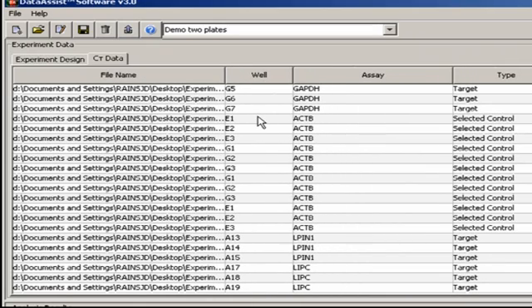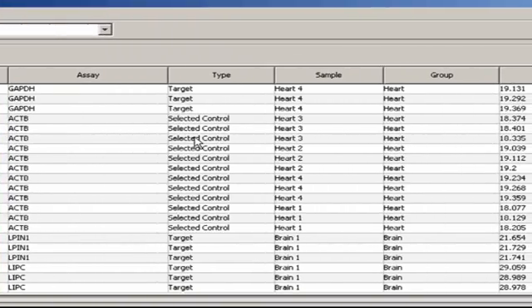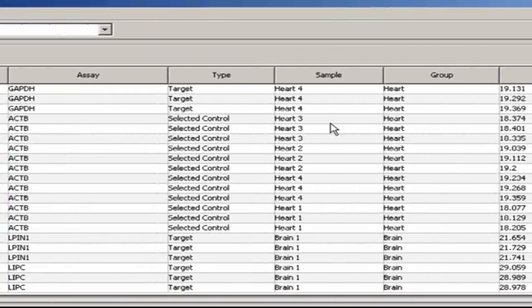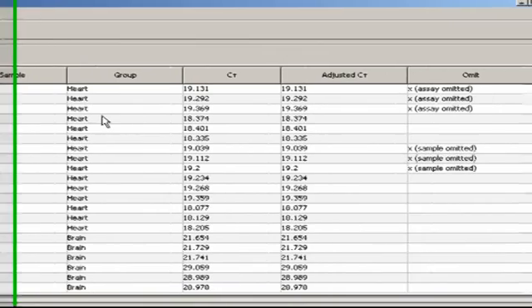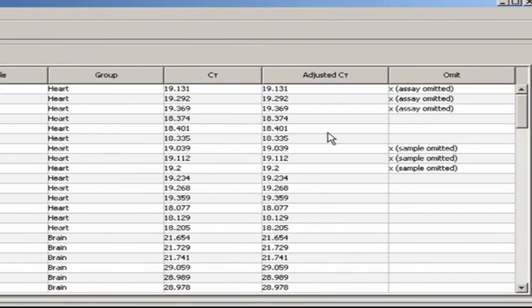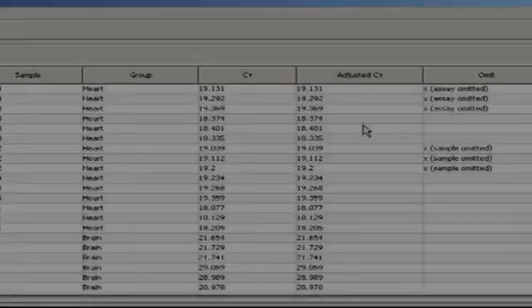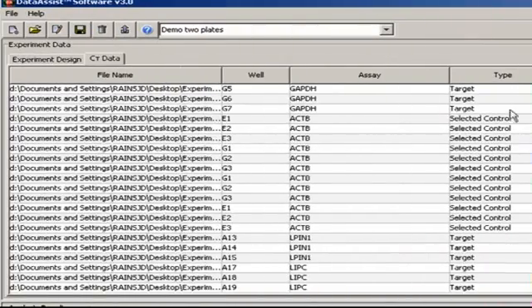The next few columns contain each sample's original well designation on the real-time plate, the assay name in that well, assay type, sample name, the biological grouping we assigned, the CT for each sample, and adjusted CT.